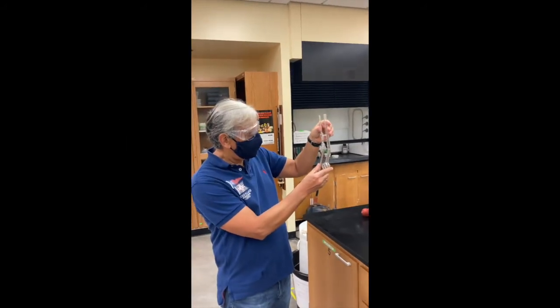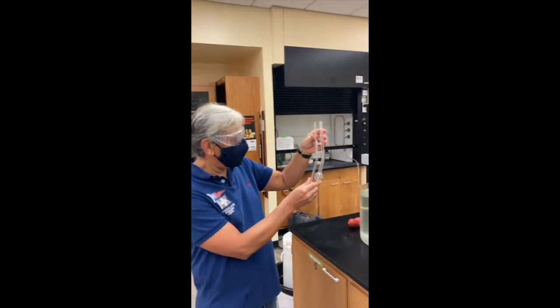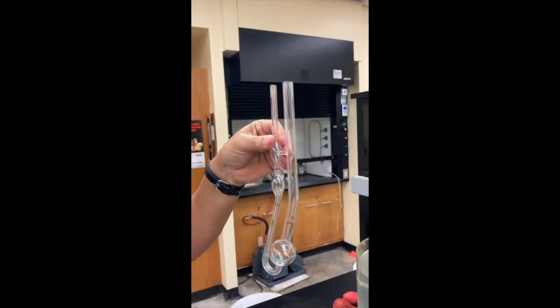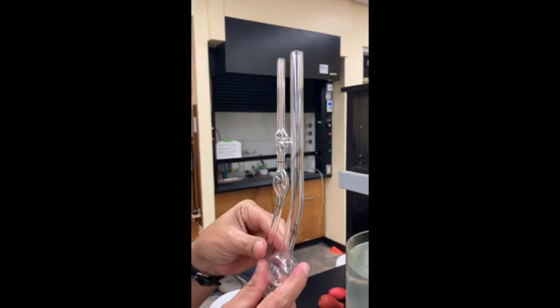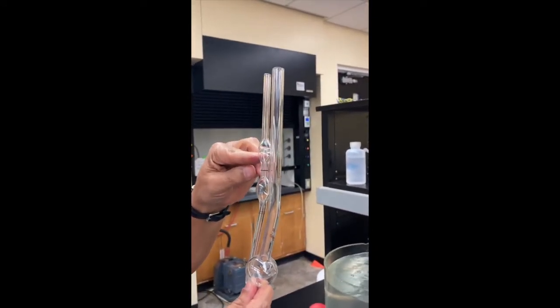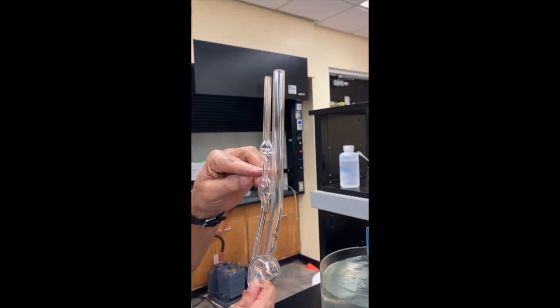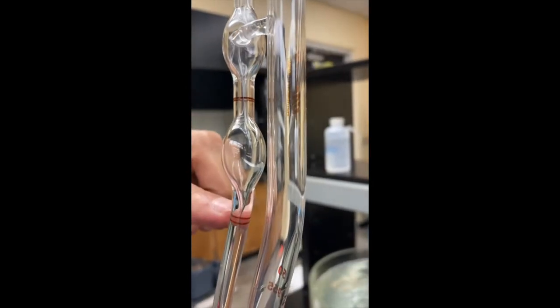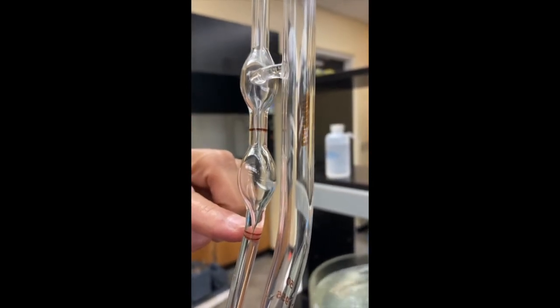Okay, this is the device which is called viscosimeter, also called Ostwald viscosimeter, and it is used to measure the time the liquid flows between these two marks. They are called fiducial marks. This is the upper fiducial mark, and this is the lower fiducial mark.